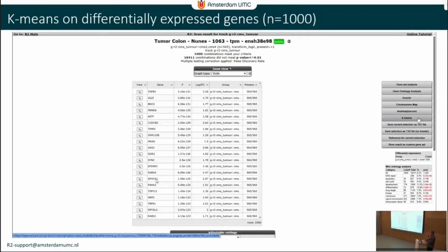So another kind of analysis that you can perform, I'm not sure if it's biologically the most sensible one, but it's just showing you the principle that I would like to produce here as well. So we can use these 1000 genes that we picked up in the differential expression analysis and then ask the question, can we use those 1000 genes to take our cohort and segregate it in such a way that we can define X number of groups?